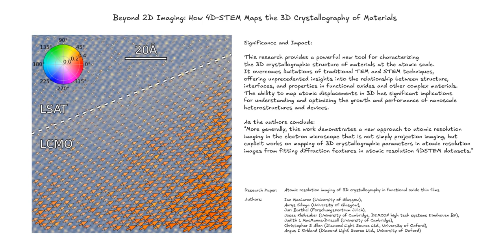Another area of interest is expanding the range of materials that can be studied using 4D STEM. Current systems are primarily limited to studying crystalline materials, but there is growing interest in developing techniques for imaging amorphous materials and biological samples. The development of new sample preparation techniques and imaging modes could enable the study of a wider variety of materials.